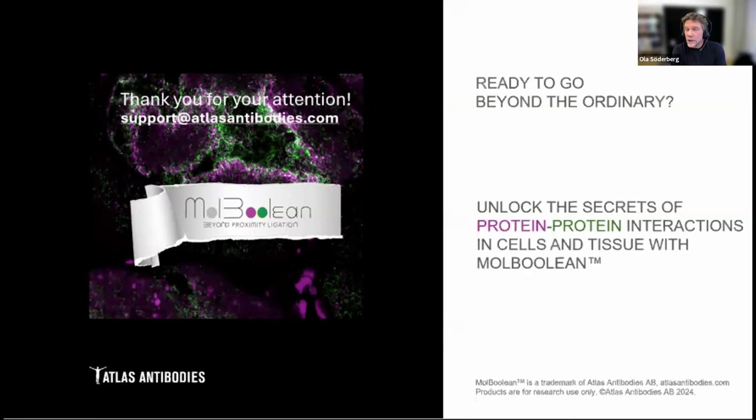And for post-mortem or surgically resected samples, I think it's always different depending on which proteins you're interested in. Does it change? Are the proteins degraded? If you look at post-translational modifications that are short-lived, you need to get the tissue to fixation as quickly as possible.